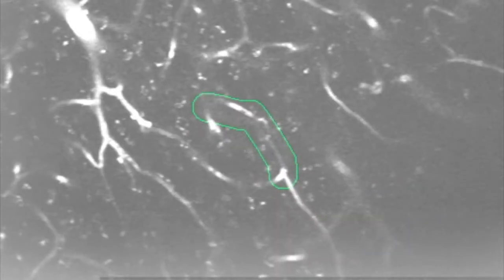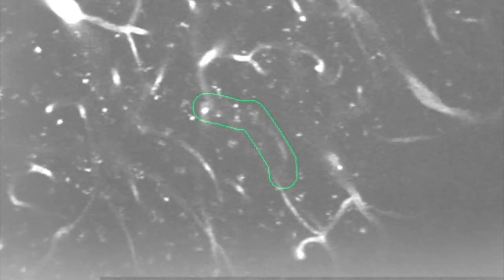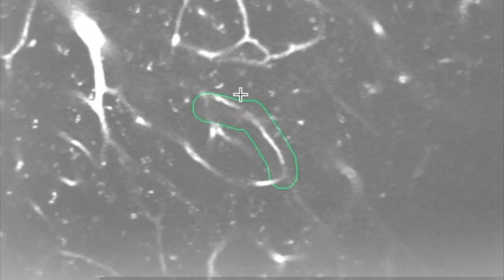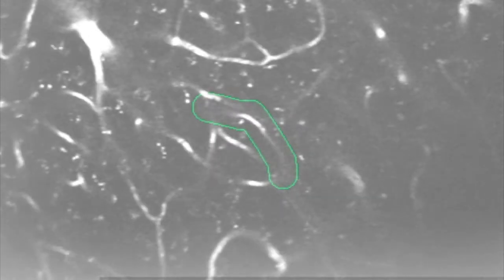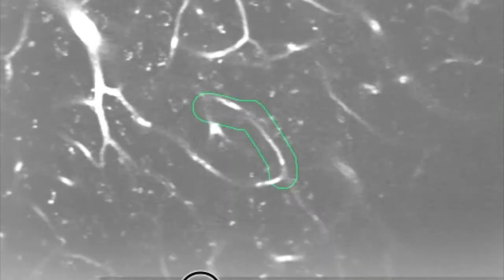And the way we know that is because if you look at the original one I showed you, if I look at the white here and then I follow where it goes, you can see it up here, traveling further, and I'm going to keep going. You see it go up here. At this point, it should be branching off into two different directions. Instead, it keeps flowing up over here, which shows that the branching point did not occur at the end of the green outline. And that's how we know that that vessel wasn't a piece of vasculature that we wanted you to analyze at this point.